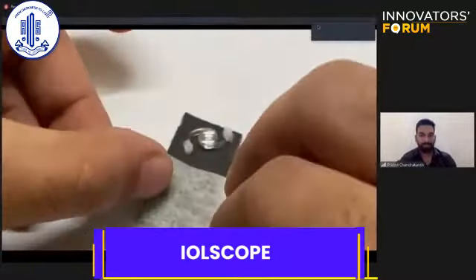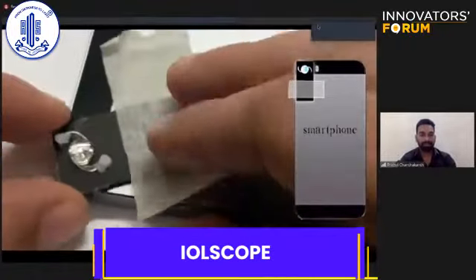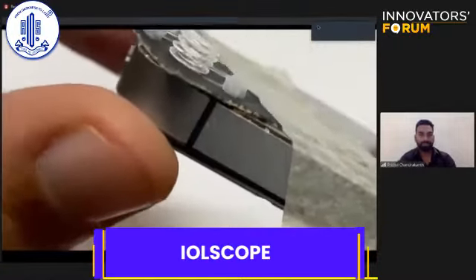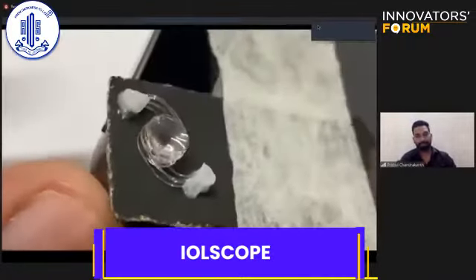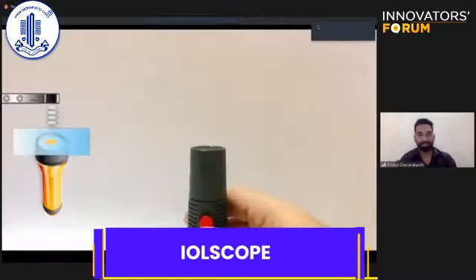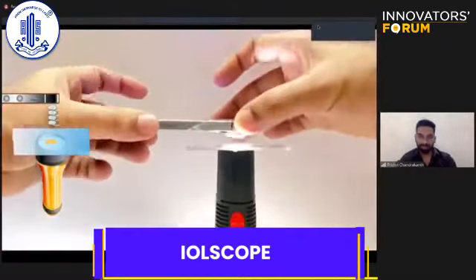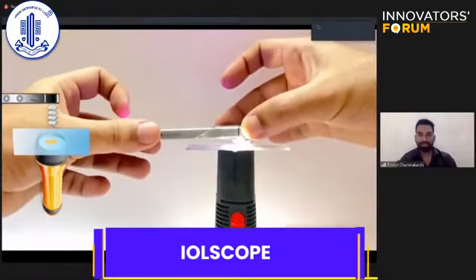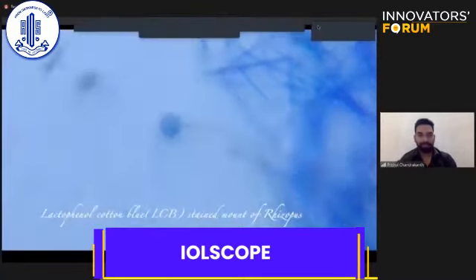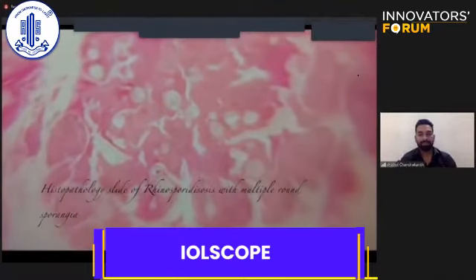Now with the help of a micropore, we can attach the IOLSCOPE onto the camera of a smartphone. How to use? With the help of torch for illumination of the sample slide, the IOLSCOPE is used to acquire microscopic images of the sample. The image and video is then recorded and can also be relayed for expert opinion. Here are a few videos of rhizopus, fungal hyphae, caterpillar hair, rhinosporidiosis and inflammatory cells.